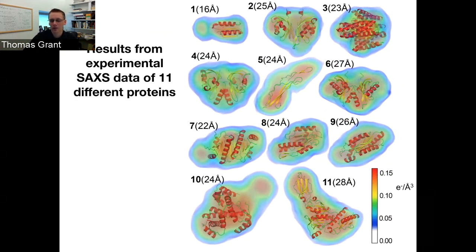Similarly to number 10 here, a large chunk of 20 to 25% of the residues were missing. You can figure out how to align your particle based on where the terminal residue is, where those residues are attached. And that gives you some rough idea at low resolution of where those extra residues are.